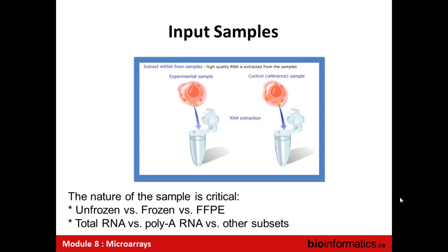And now you say, oh, I expect that there are no technical differences. Well, it turns out that you can trivially detect the RNA and DNA differences in those types of samples. The sample preparation has as big or bigger an effect on all of your data than anything about bioinformatics. So your upfront design to make sure that your samples are similar and consistent is critical.